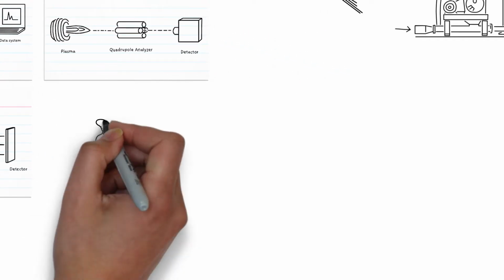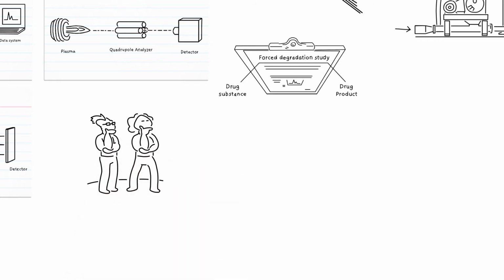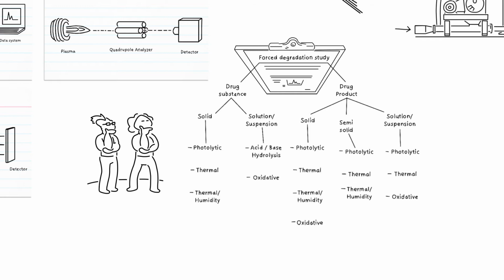Analytical Sciences also performs forced degradation studies, where we intentionally stress and break down the API or drug product to identify potential degradants and impurities.